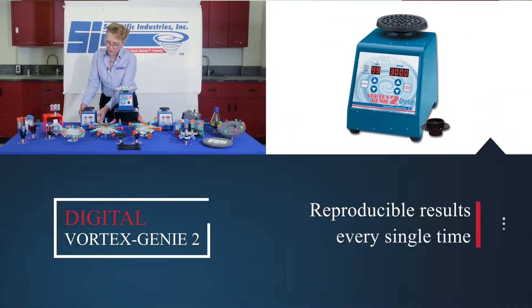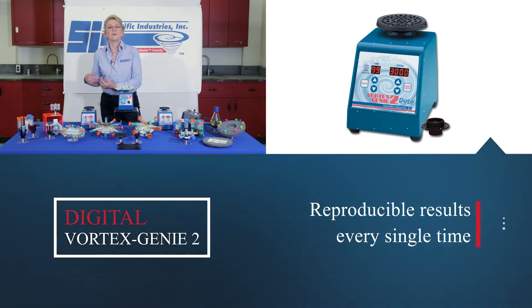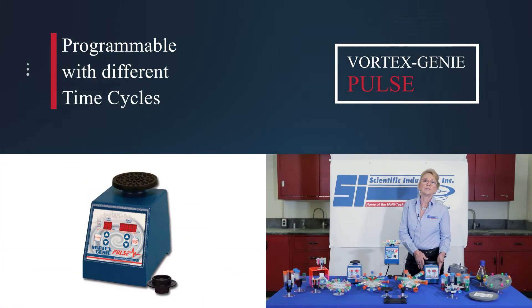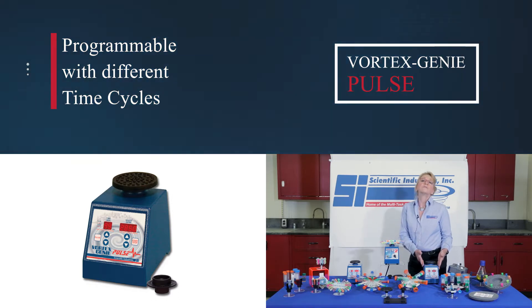We have a digital version of the Vortex Genie, and the benefit of that is for reproducible results every single time — speed and time. We also have the Vortex Genie Pulse, which is programmable, so you can set your vortexer to vortex for X amount of time on and X amount of time off for a total cycle time.